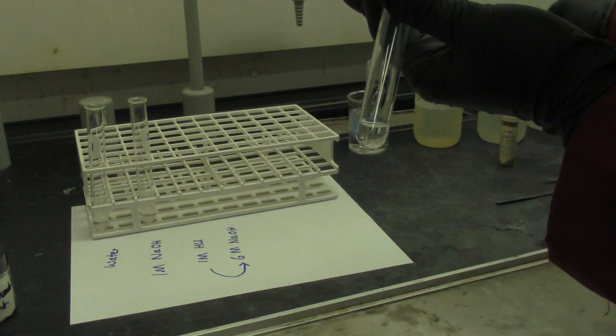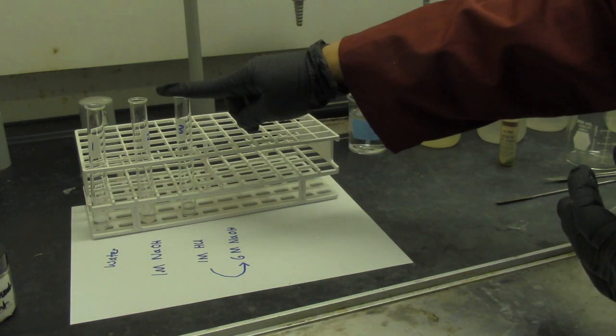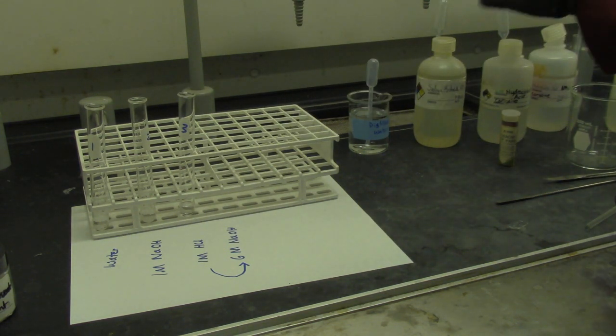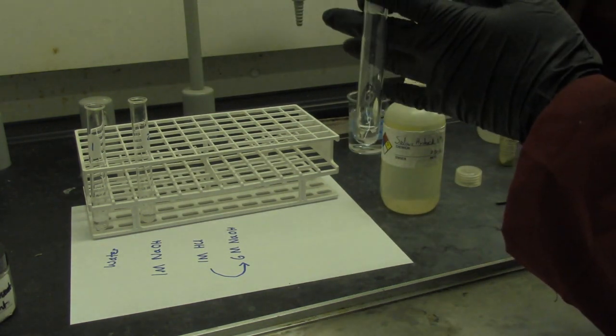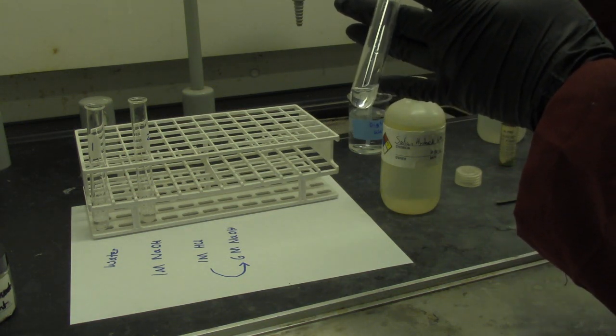To this test tube, number 3, we will add 6 molar sodium hydroxide, just a few drops. Let's see what happens.